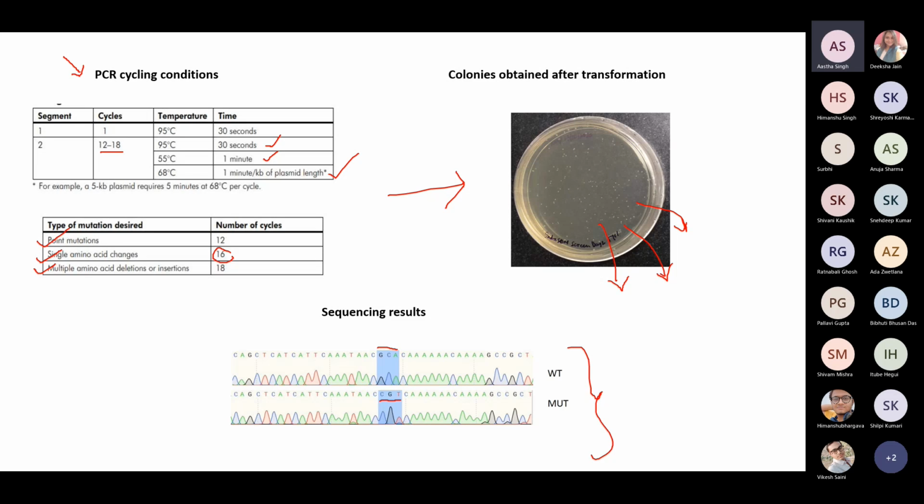So that's pretty much it. And regarding primer design, just follow the few points that I had mentioned. Try to keep them in mind. And I think Garima has taught you how to clone up to 1000 bases upstream of your gene's transcription site.